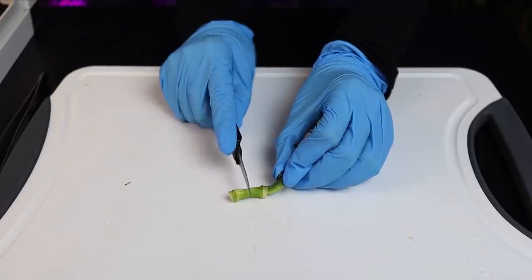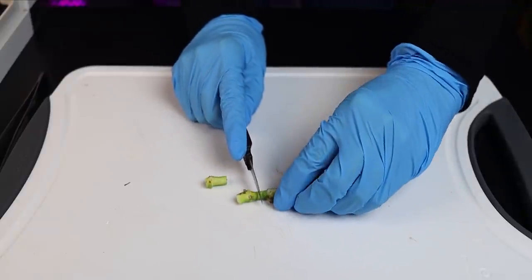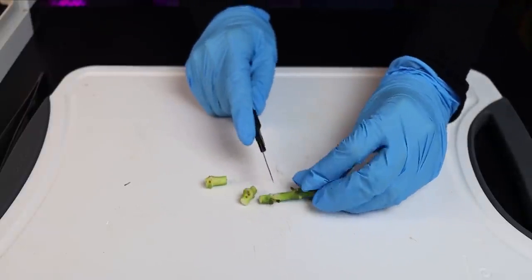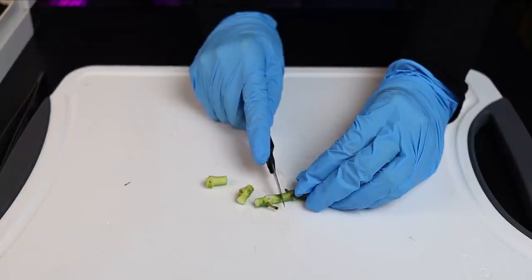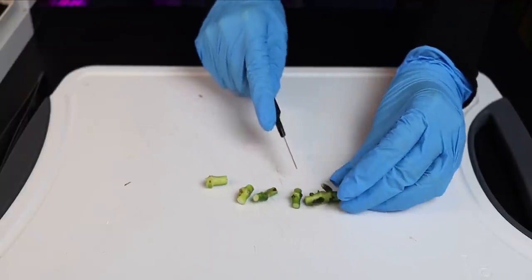I'm chopping this plant into nodes. Now this doesn't need to be done in the laminar flow. In fact, it's probably best not to, as we haven't sterilized any of the plant nodes just yet. This way we can keep our tissue culture area clean and contaminant free.